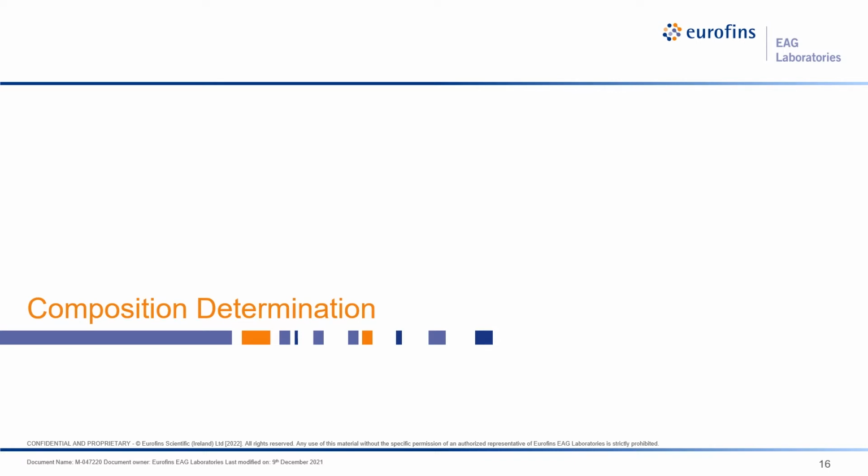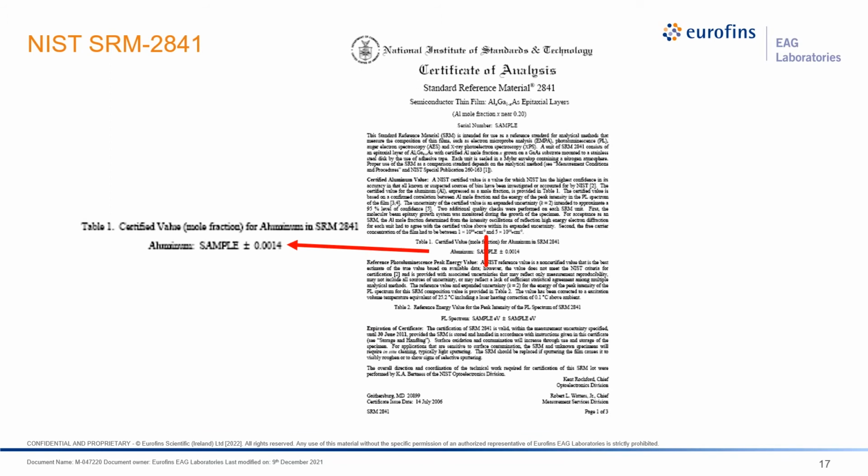And there were, at the time, a lot of studies in the SIMS community to measure AlGaAs compositions, and several articles got published in quantifying AlGaAs in aluminum to gallium ratio. But it required that you have a reference material. And for a long time, the lack of AlGaAs reference material made it very difficult for us to confirm our results.